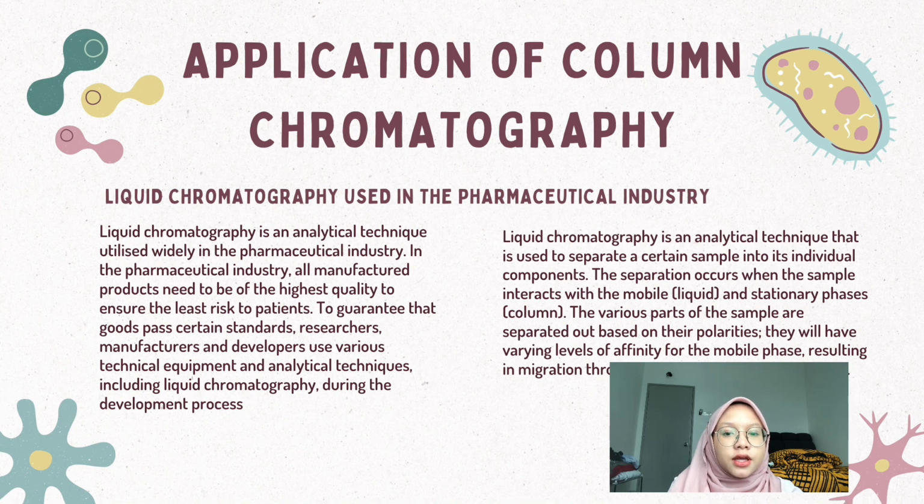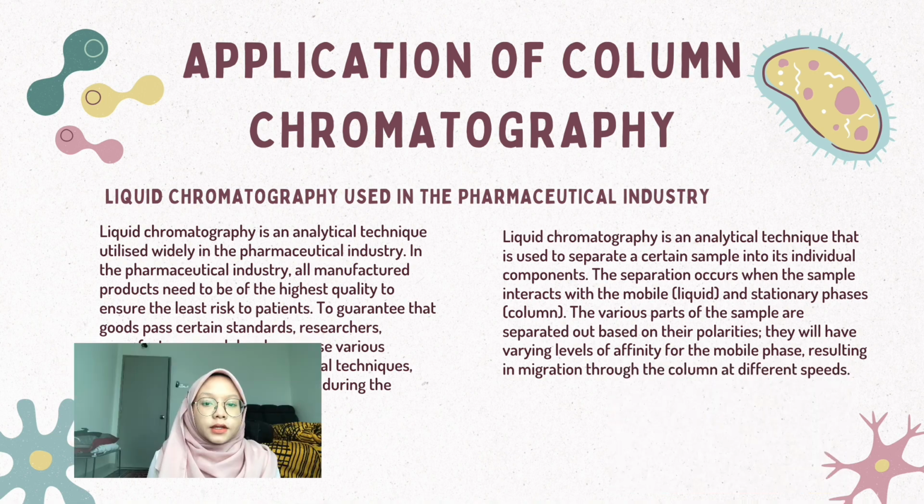In this industry, our manufactured products need to be of the highest quality to ensure the least risk to patients. It is also to guarantee that goods meet certain standards. Researchers, manufacturers, and developers use various technical equipment and analytical techniques, including liquid chromatography, during their development process. Not just that, liquid chromatography is also used to separate a certain sample into its individual components.